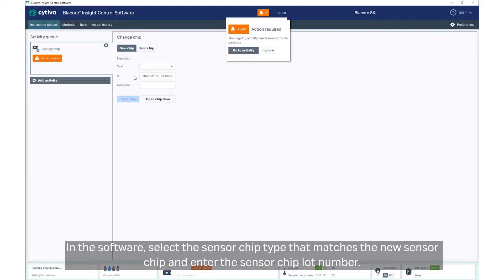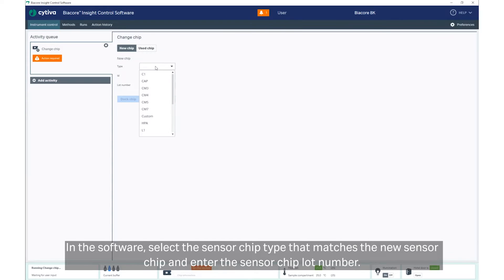In the software, select the sensor chip type that matches the new sensor chip and enter the sensor chip lot number.